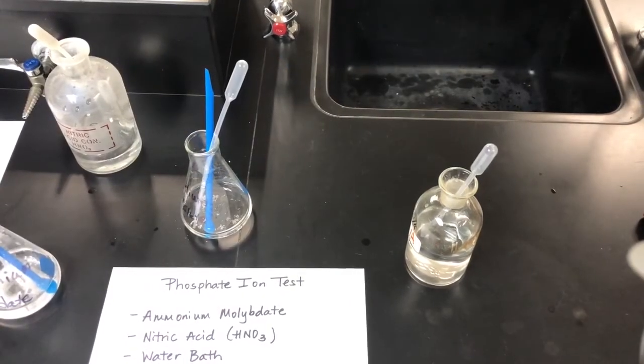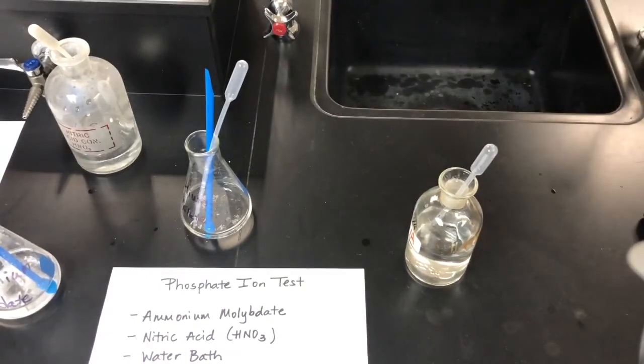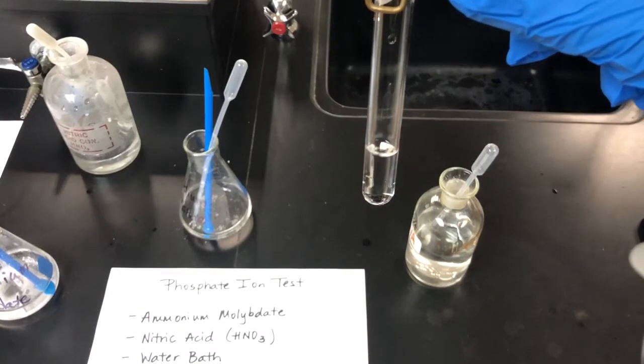Okay, so what I'm going to do is I'm going to show you the known. So this will be the top box for your phosphate test. Okay, this is what it should look like if it's positive. It should have turned yellow. And then our unknown did not turn yellow. So we're going to say that it's negative for the phosphate ion test.